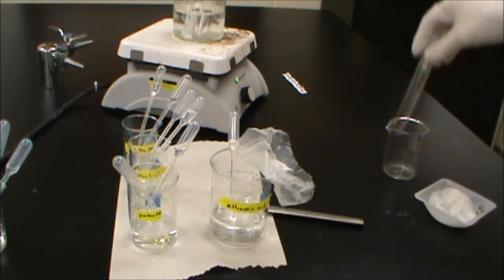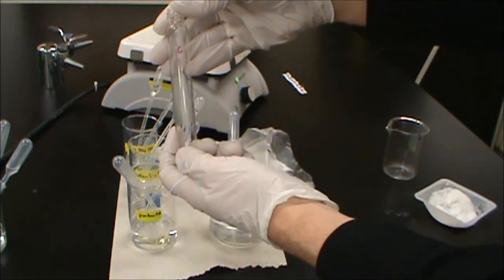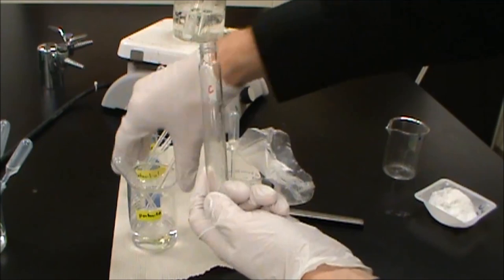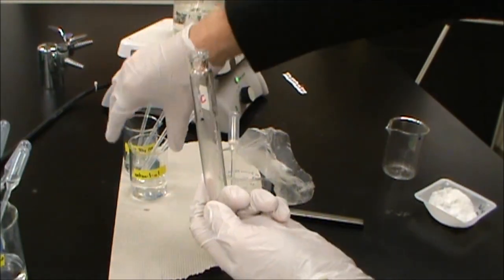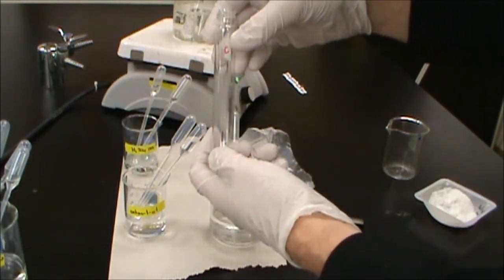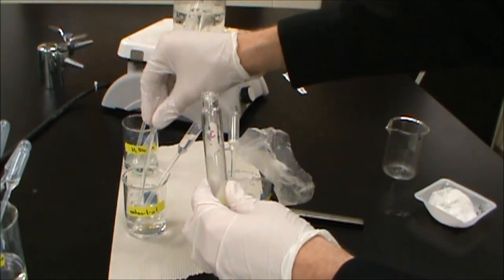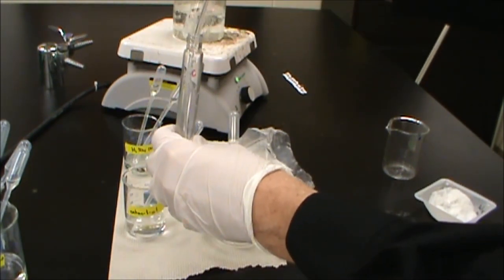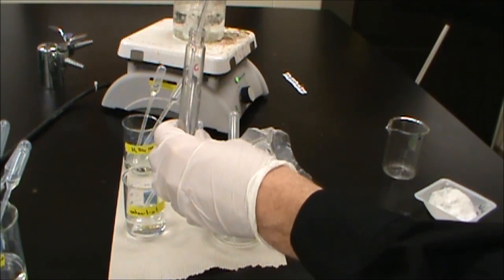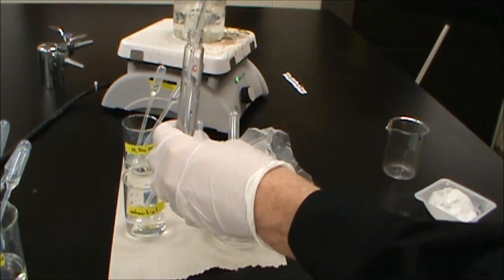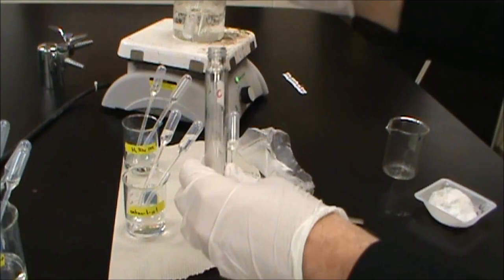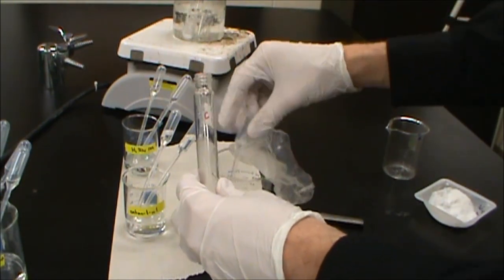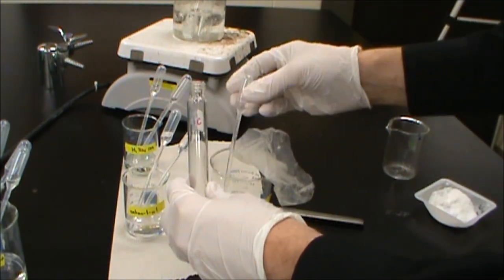And then our third one here. So we have our third test tube. And for this one, we're going to do yet another alcohol. This time we have octan-1-ol or octyl alcohol. And again, here we're going to do 20 drops. And we're going to do 20 drops of the ethanoic acid again. So we're going to use the glacial acetic acid twice here.